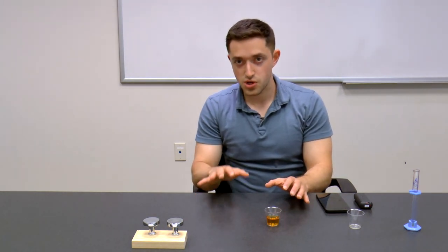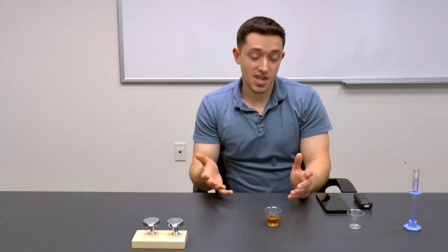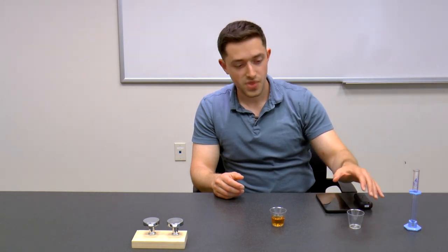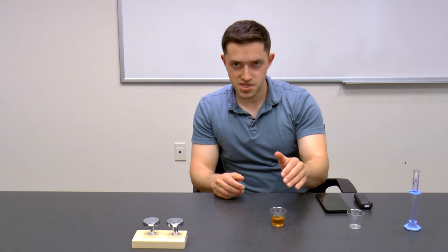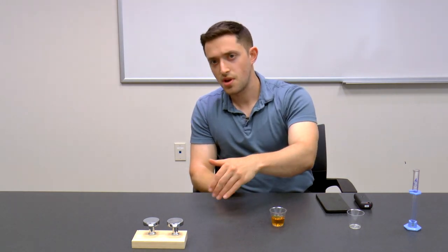The entire process I laid out is called transmission mode measurement, and it might seem a little cumbersome — and quite frankly, it is. You need a calibrated light source at 430 nanometers, a light guide to the beer, the beer in a cubic centimeter cuvette, another light guide to the spectrometer, and then a signal going to your PC for analysis.